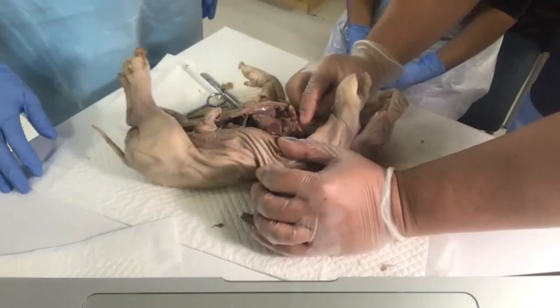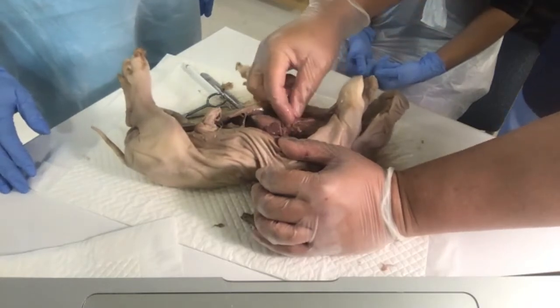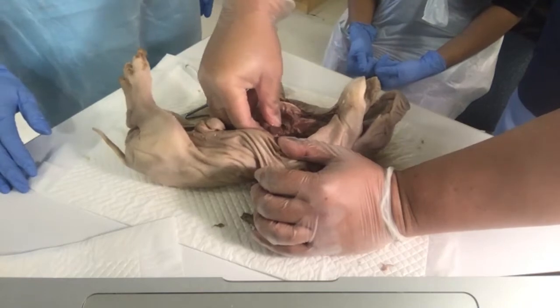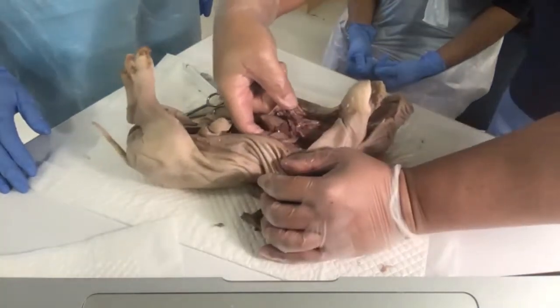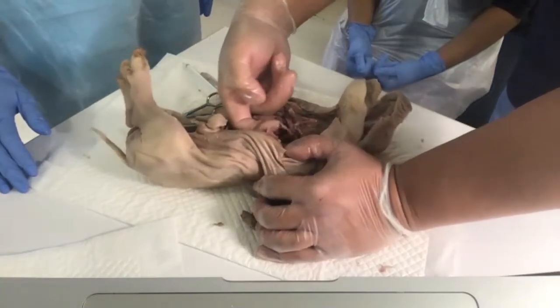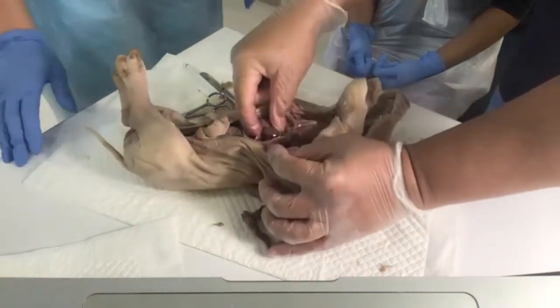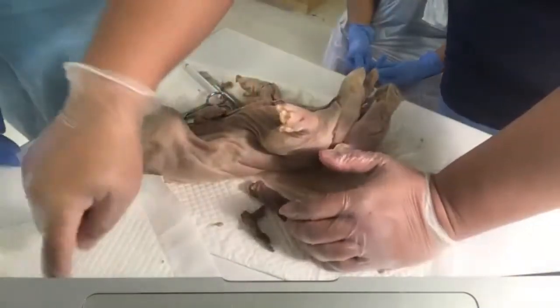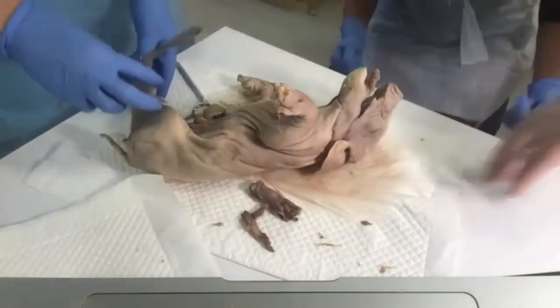What is this? Well, of course, you could see it's a patent artery, right? It's open, right? So when I start doing this, and it's connected to your heart. So if you look at this, see how tough it is, relatively? And this is the pericardium, it covers the heart. So you take out the heart and the lungs, and then I want you to put it here, and then we can look at it. And assist when you can.